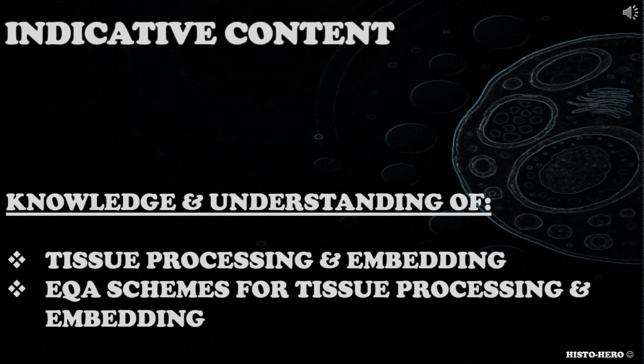Understanding relevant to EQA schemes for tissue processing and embedding, and being able to interpret and act upon the results. What are the EQA schemes for tissue processing and embedding? What do the EQA results mean? How would you interpret them? How would you address poor EQA results?